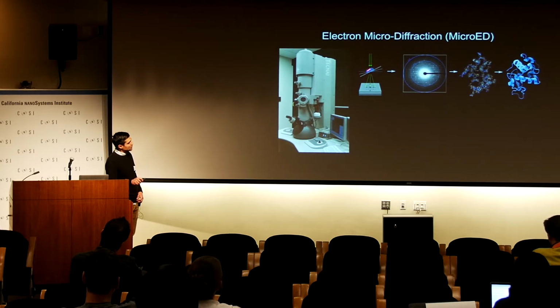This diagram represents that type of interaction. Here's the beam of electrons. This is your crystal, which then can tilt within the beam. At each orientation, you record a diffraction pattern. The whole thing amounts to having a movie, and from this diffraction movie, especially if you have a prior guess for what your sample might look like, you could try to derive a structure.